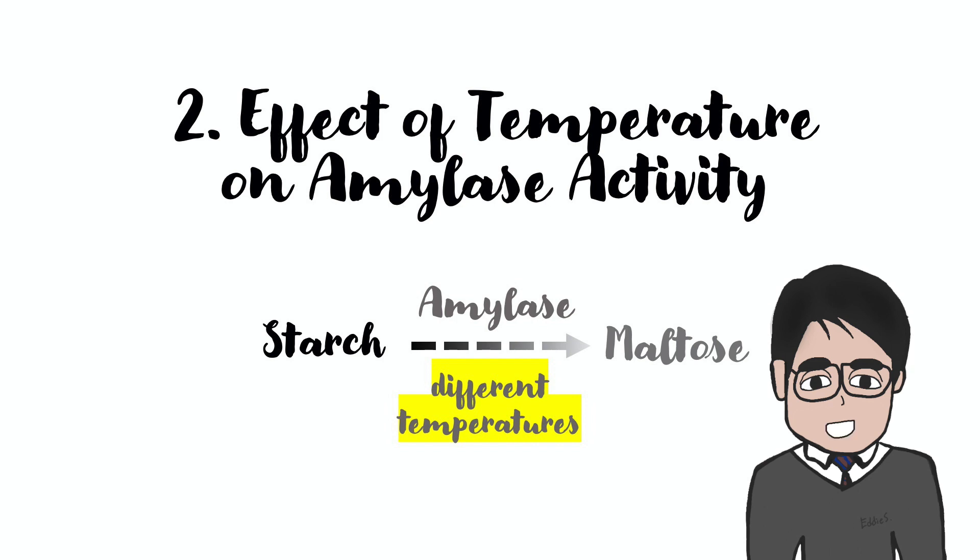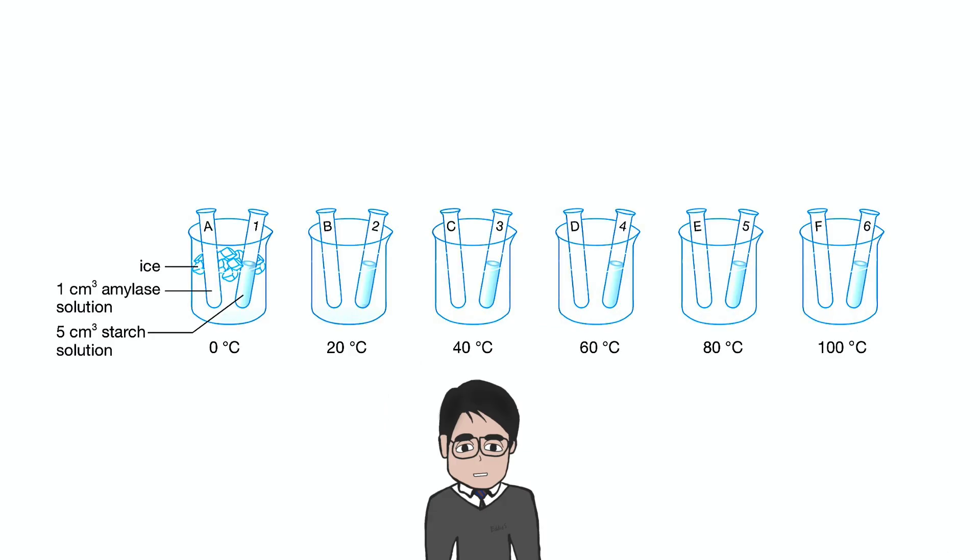Okay, now let's go to the second experiment. The aim of the second experiment is to investigate the effect of temperature on amylase activity. Amylase is the enzyme that converts starch into maltose. Before the reaction starts, we have to make sure both the amylase solution and starch solution are at their designated temperatures.